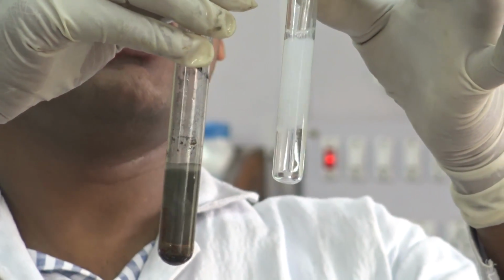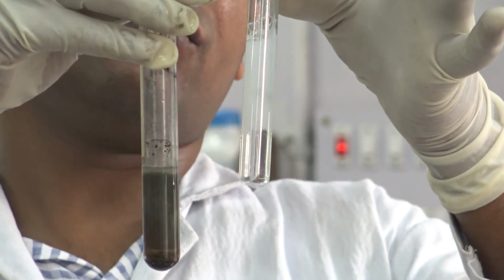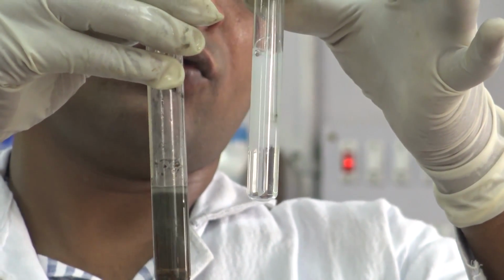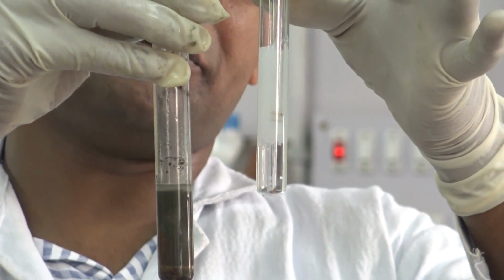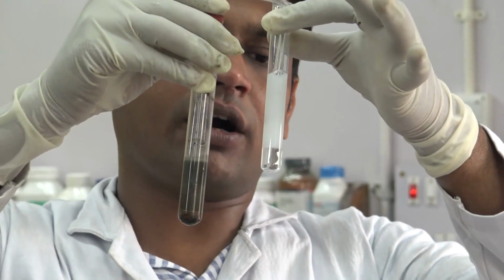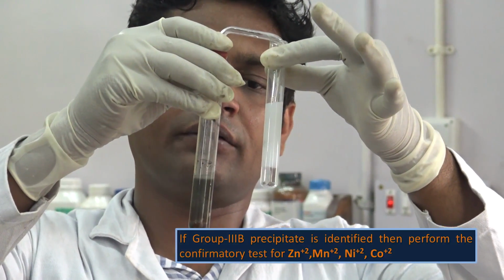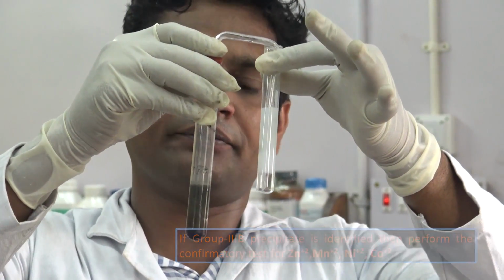Here we can see a white precipitation occurs. If manganese is present, then the color should be flesh color. For nickel and cobalt, it will give a black precipitation. If these types of precipitation occur using the group 3B reagent, then we have to perform the test for zinc, manganese, nickel and cobalt.